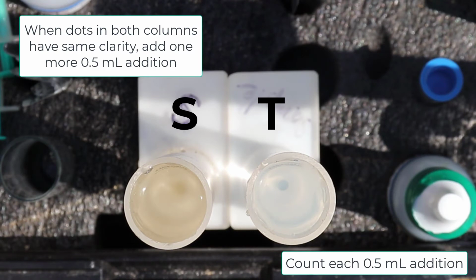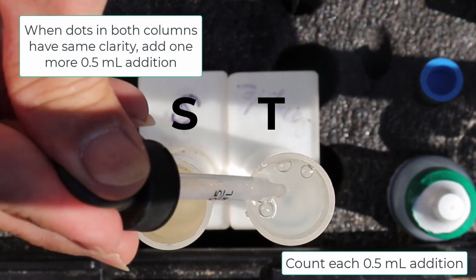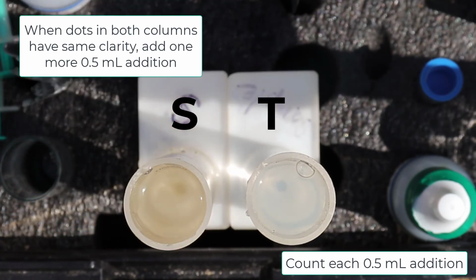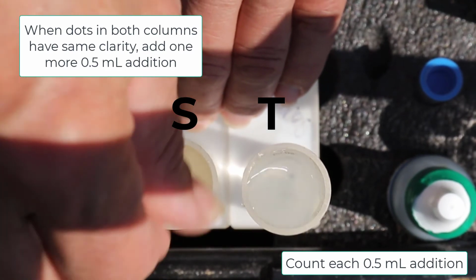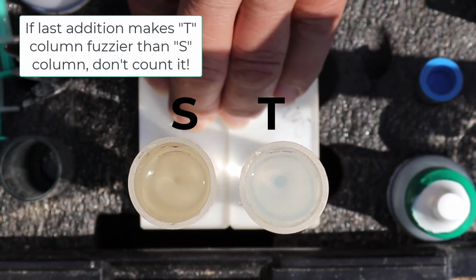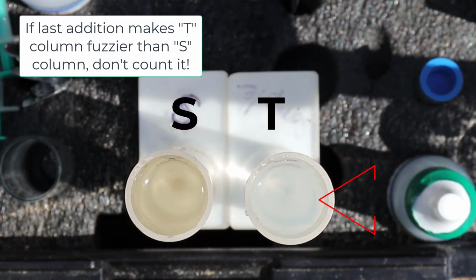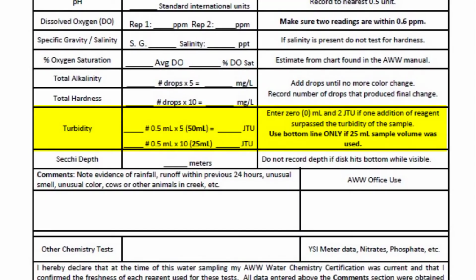Once the dots at the bottom of the T and S columns have the same clarity, or in other words, once you have reached the titration endpoint, add one more 0.5 milliliter addition. If the last addition causes the dot at the bottom of the T column to be fuzzier than the S column, it confirms that the previous addition was the endpoint. Record the number of the 0.5 milliliter additions you added to the control, not counting the last addition.